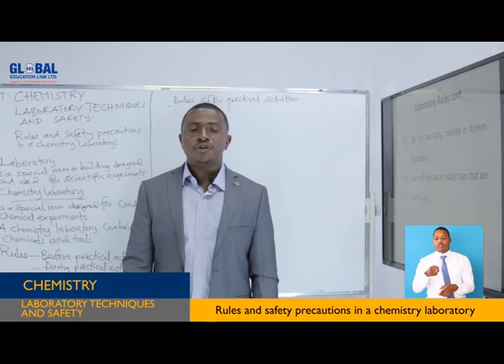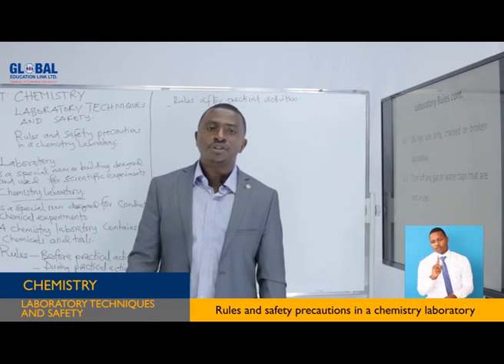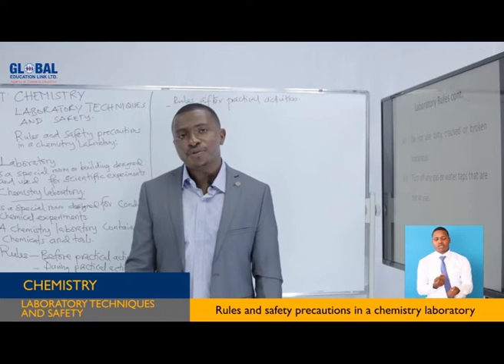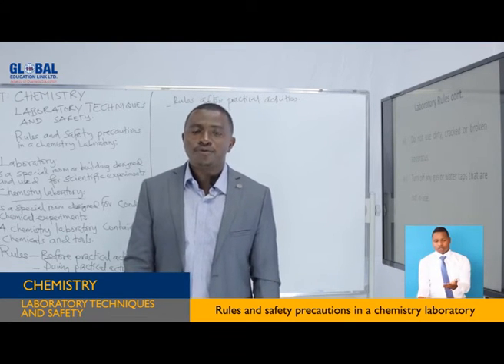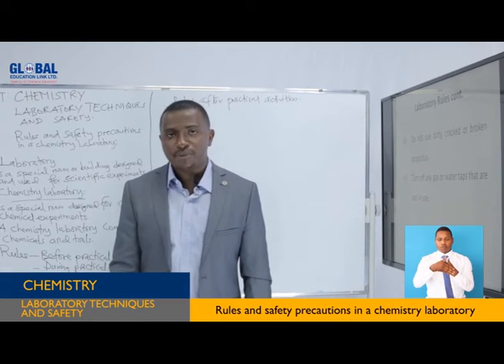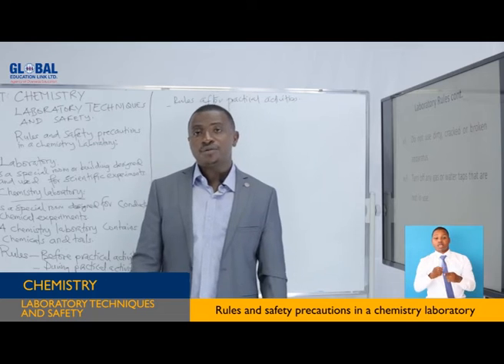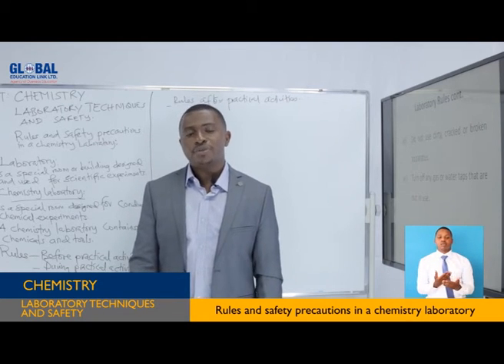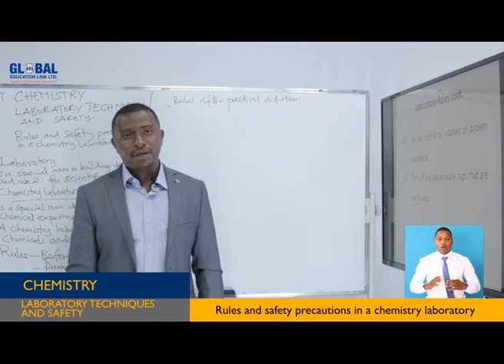This is economically not good, and excess water can lead to spillage of liquids, which can result in falls. Therefore, you better turn off the water taps. Also, accumulation of gases in the laboratory can lead to accidents such as fire. So you better turn off the water taps and the gas taps.